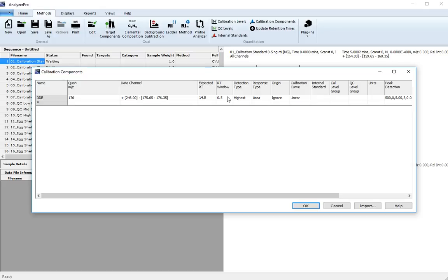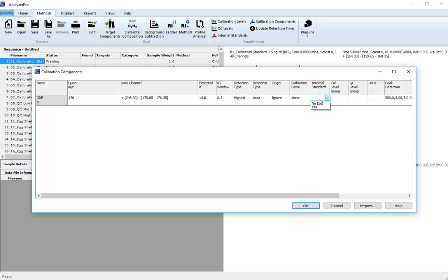The retention time window can be left at 0.5, detection type at highest, response type is area, ignore the origin, the calibration curve is linear, the internal standard as we previously defined is TPP, the calibration level group is Cal level group 1.